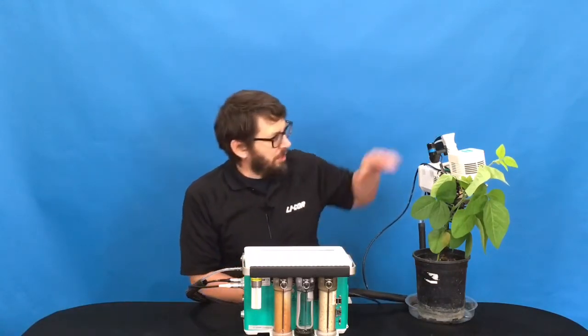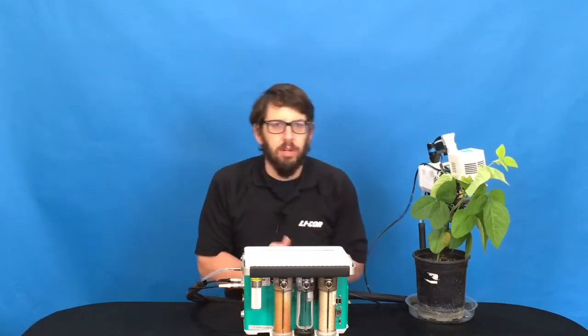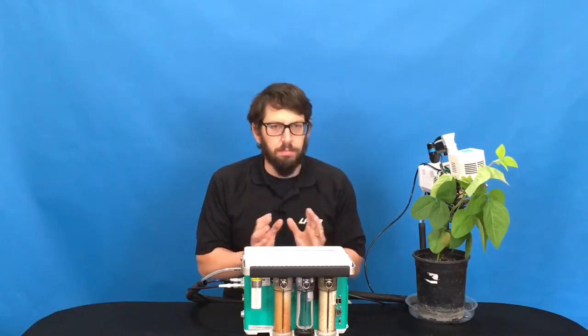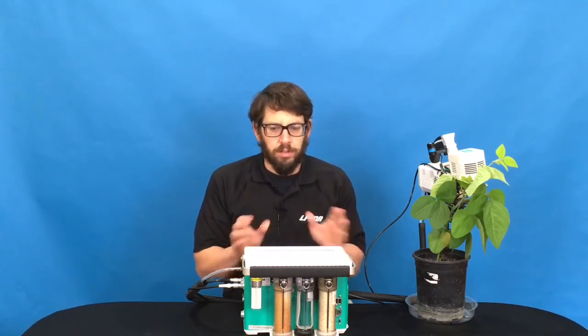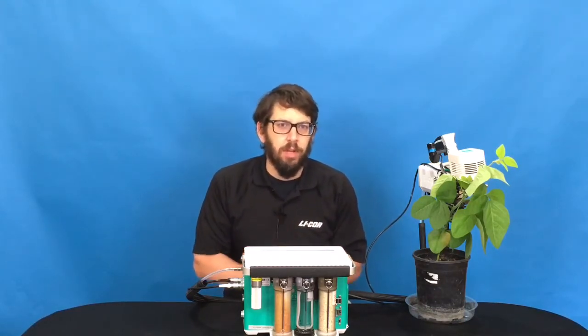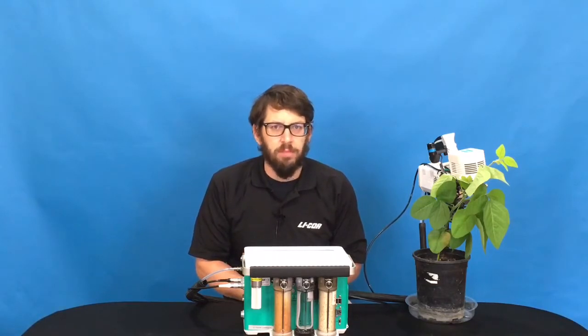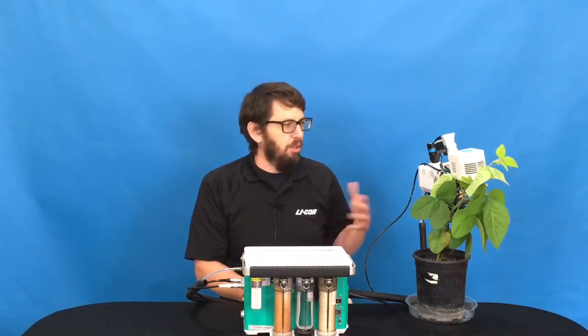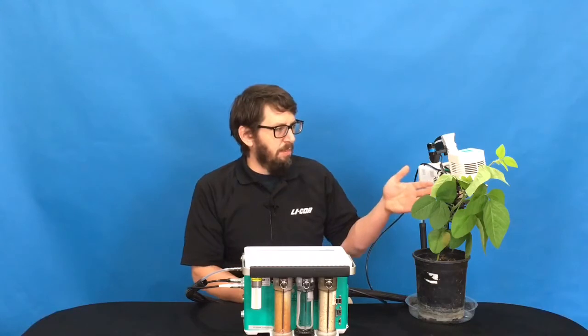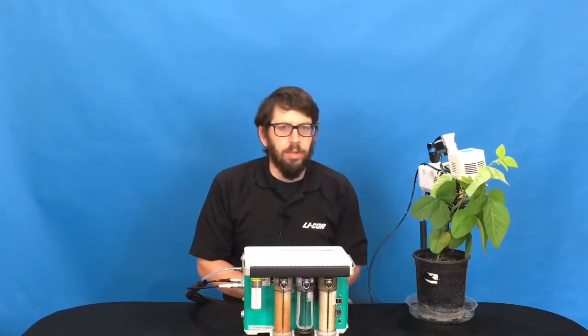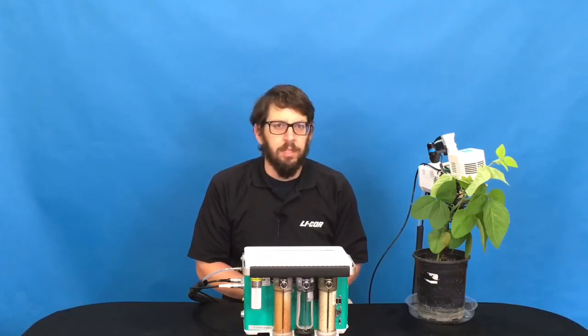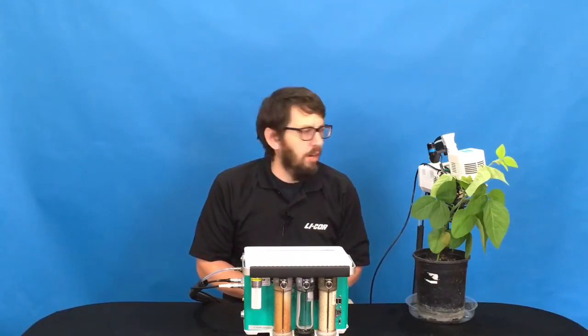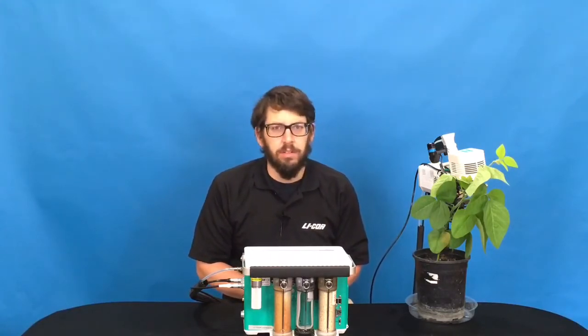So for today's demo we have the fluorometer chamber on board. Some quick important considerations to make when setting up for a survey measurement include thinking about the environment that your plant has been experiencing prior to clamping. And the most important variable typically to consider is the light environment.